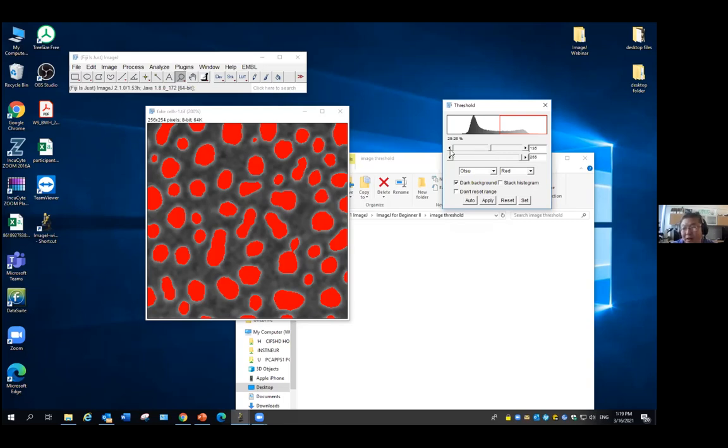So here you can say 135, 120. The value you choose decides everything in the result. If you change this from 120 to 135, all the results, the size, the total intensity, the mean intensity, will change. But that doesn't really matter that much. You want this one to be a reasonable one. But the more important thing is that you use the same value. When I go to the next image, I can still use 120 to get a reasonable outline for that.